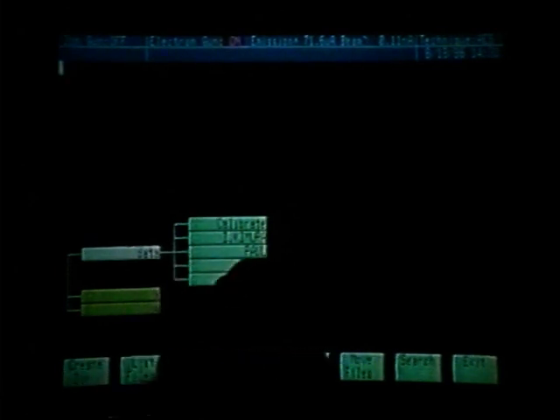We can see that what is highlighted is called data. That means any of the data that we now obtain on this sample will be stored under this major file heading. What we would like is to create a new subdirectory, which, as you can see on the right-hand side, we have many subdirectories. What we would like to do is create a new subdirectory for this set of data.